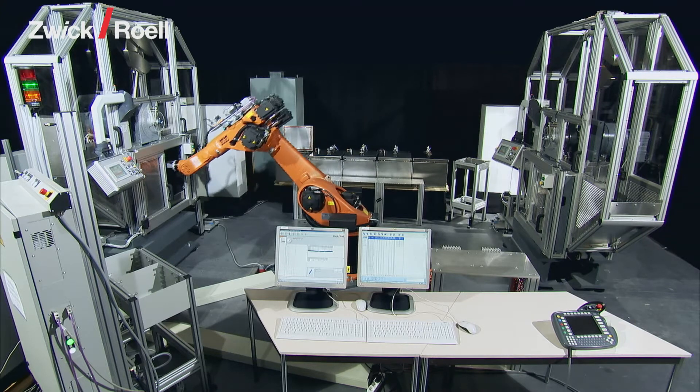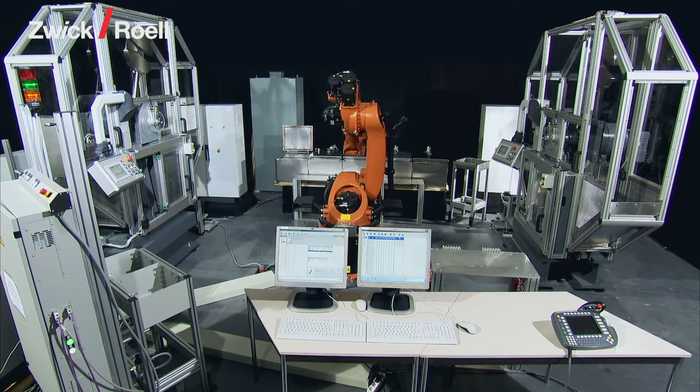The robotic testing system RoboTest-R type testing unit has been designed for the testing of notched impact bending specimens.